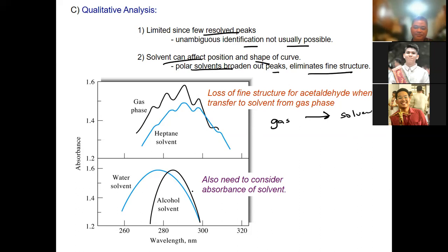And then here, kapag alcohol siya, medyo narrow yung peak niya, but when you have water, then it is broad. Okay? Now, some explanation is the difference in the environment. So it's possible that under this condition, your sample interacts with water compared to this one.